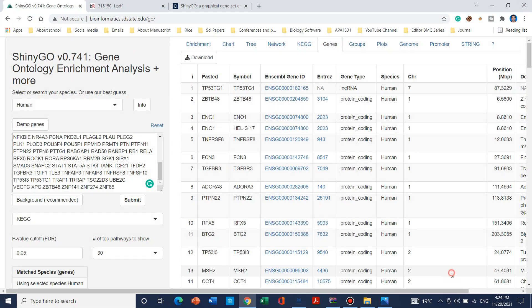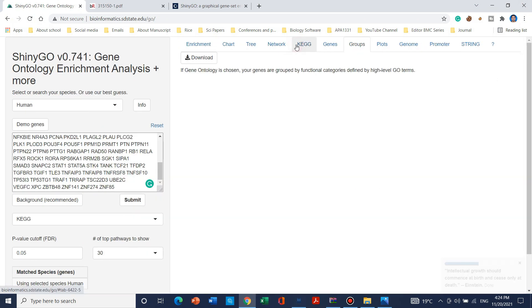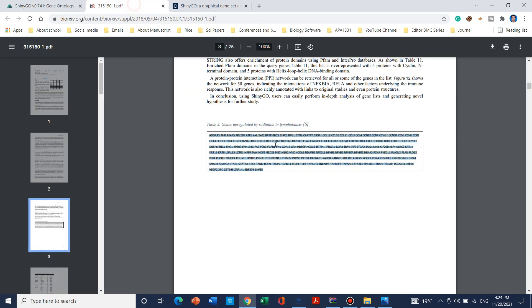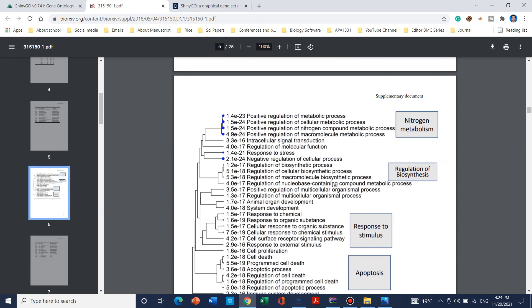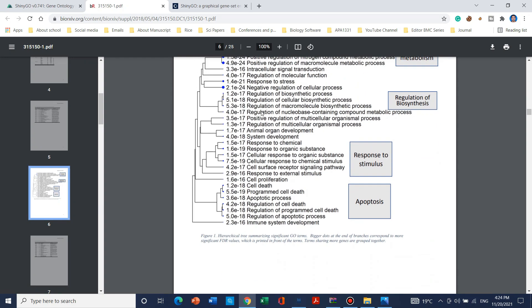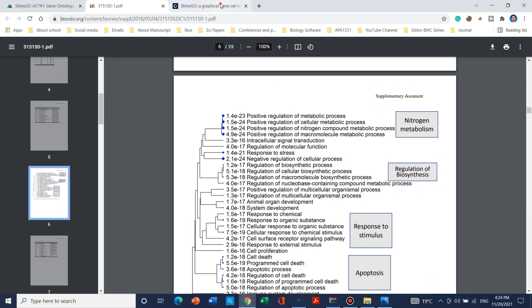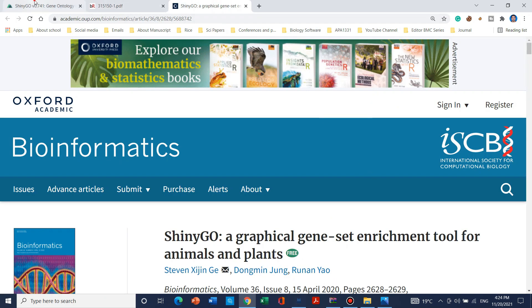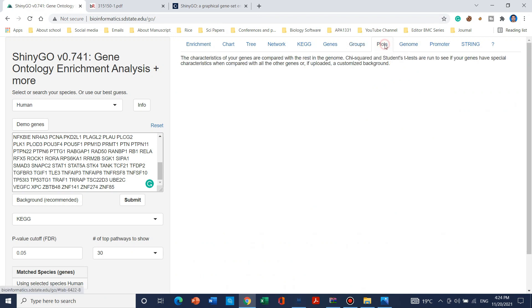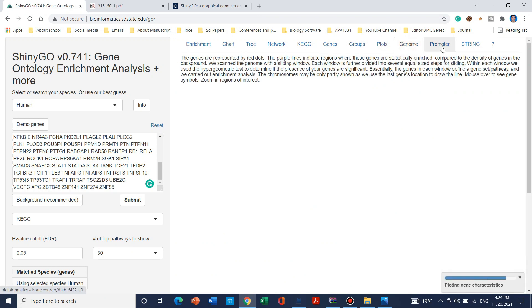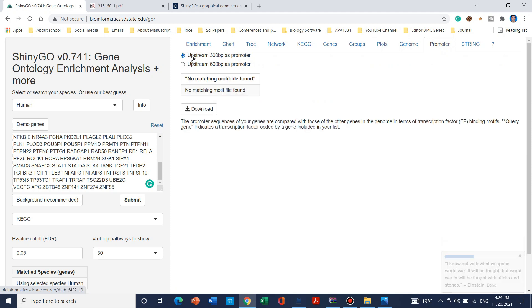Moving to Groups, you can also change this whole group into smaller parts. In this example, all the categories are broken into smaller subgroups. Similarly, you can use the Plots, Genome, and Promoter analysis features, and select how many base pairs you want as promoter — such as 300 or 600. I prefer 600 because some genes have promoters longer than 300 base pairs.